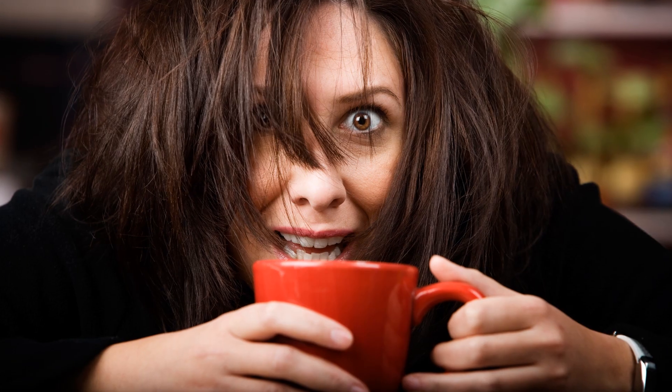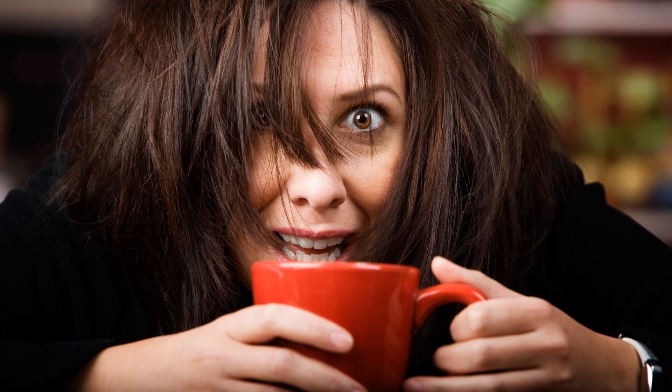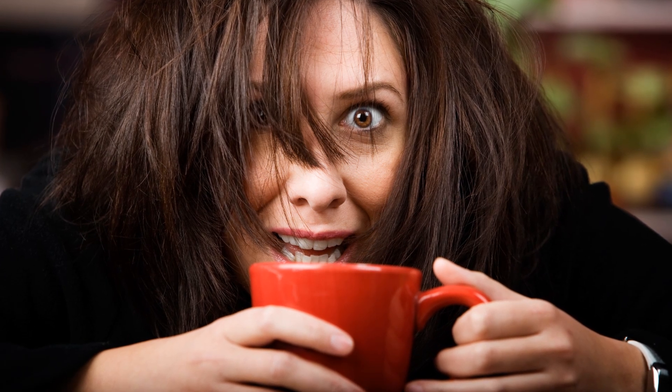If we don't know how much caffeine is in our drink, we may end up looking like this poor lady who has clearly had way too much. As consumers, we want to have just the right amount of caffeine in our drinks. In addition, the manufacturers have to operate within the appropriate legal requirements.